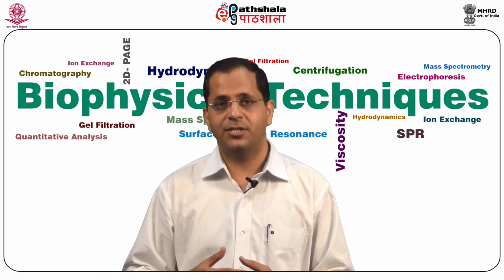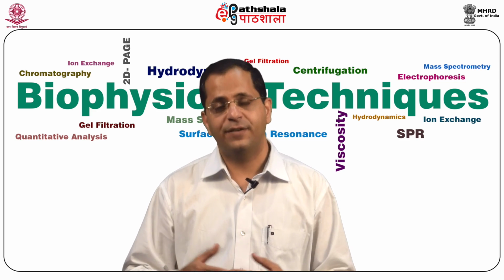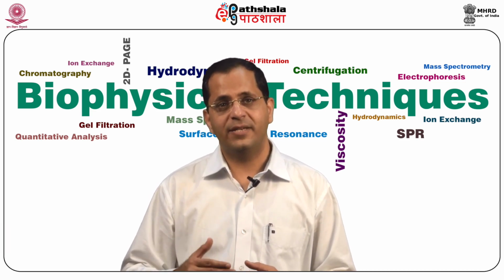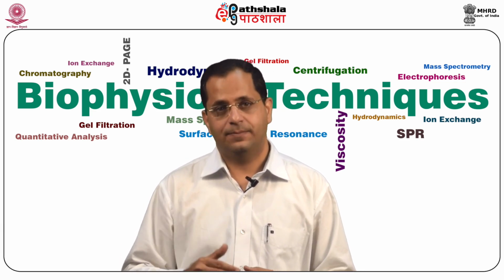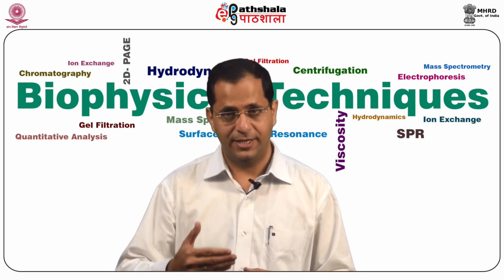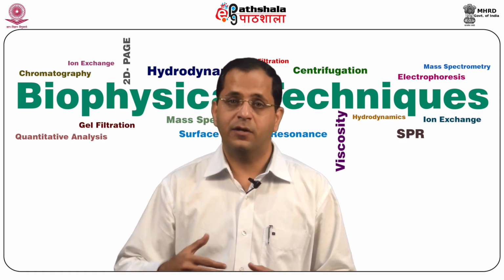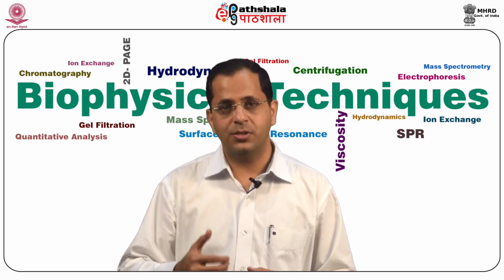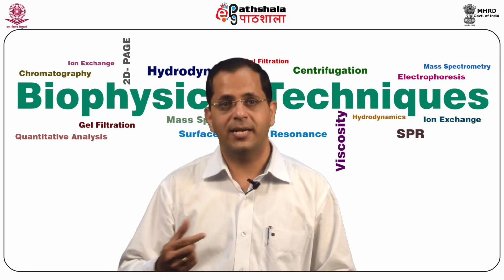Modifications of two-dimensional electrophoresis. This is what you call differential in-gel expression. 2D fluorescence difference gel electrophoresis uses an internal standard. So, the samples can be subjected to the same experimental conditions and can be easily compared and accurately quantified for different protein expression. DIGE also uses a technology of labeling proteins with cyanine fluorescent dyes.